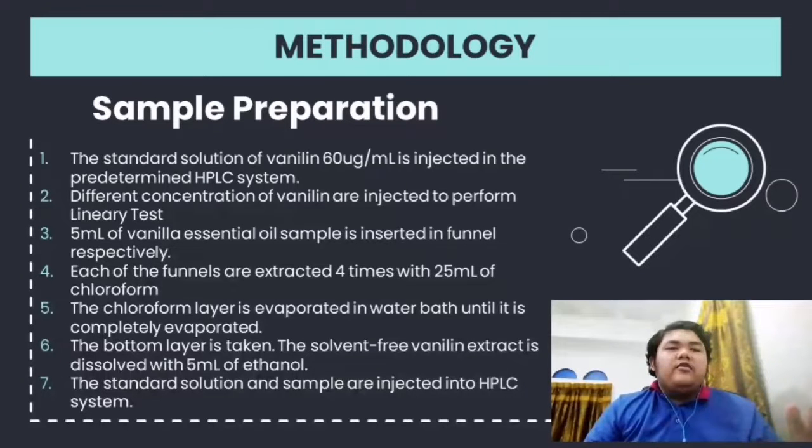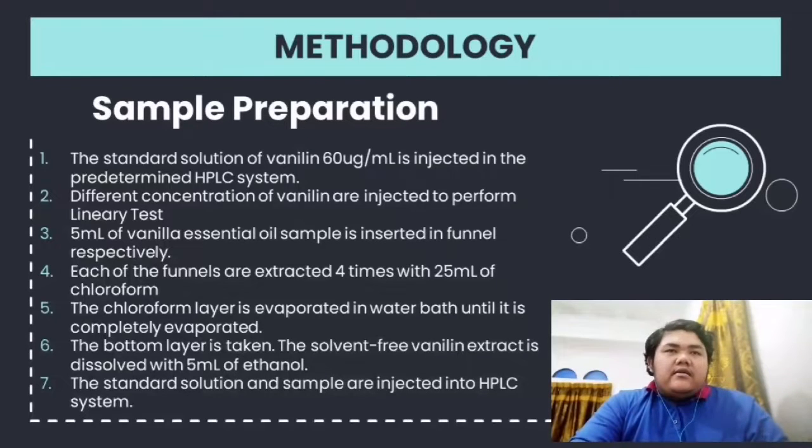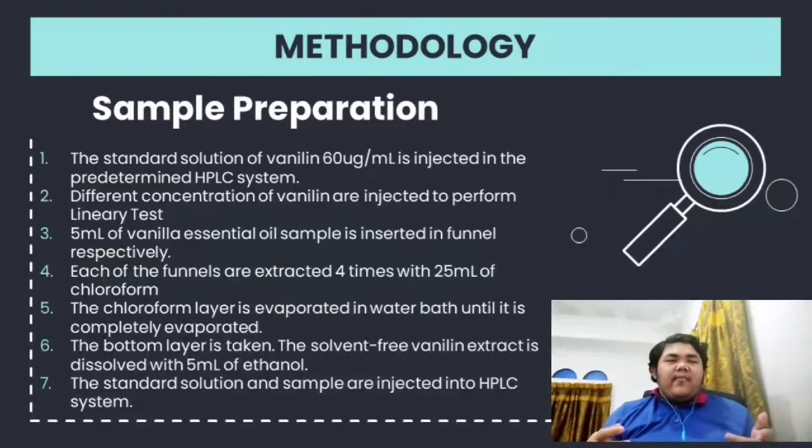Now it's time to talk about methodology. The one we are talking about is sample preparation. The first step, the standard solution of vanillin at 60 microgram per milliliter is injected into the predetermined high performance liquid chromatography system. Different concentrations of vanillin are injected to perform linearity tests.